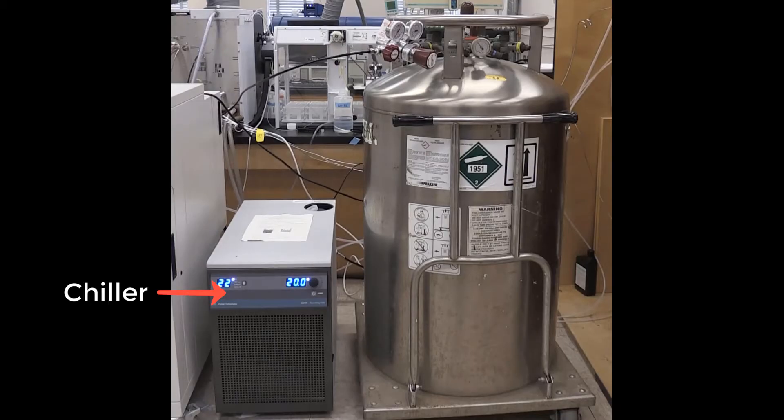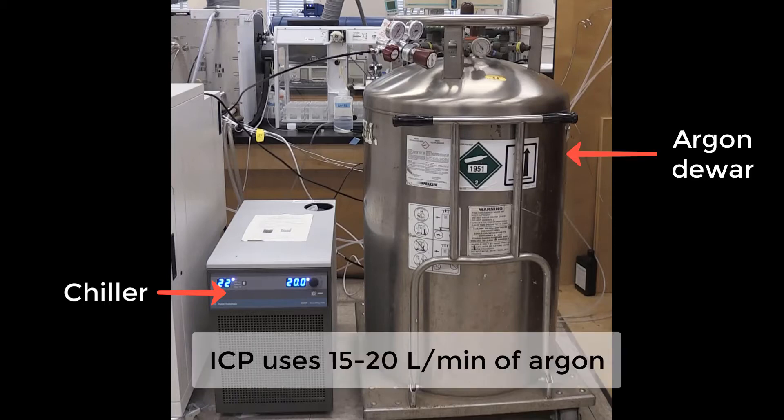An ICP requires a chiller to maintain the instrument's temperature. Sample introduction and plasma generation require a gas source.